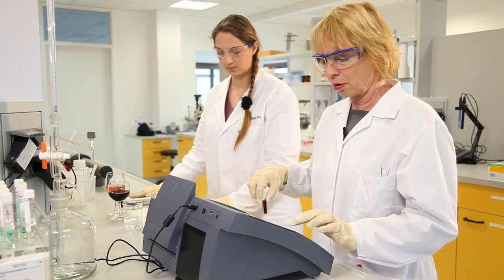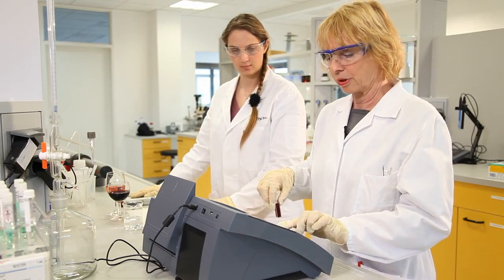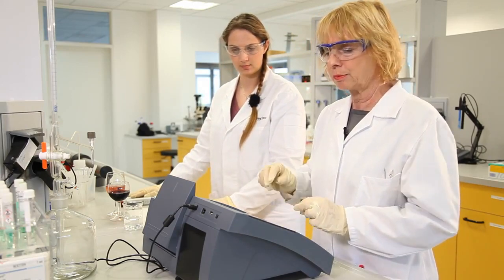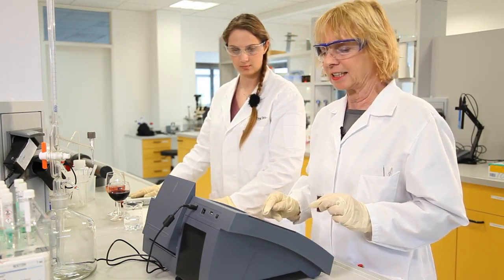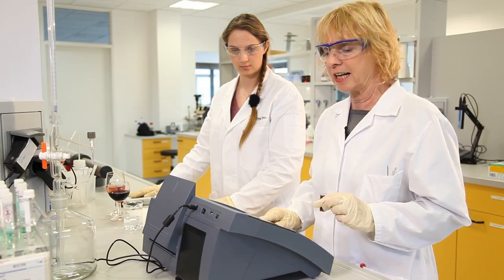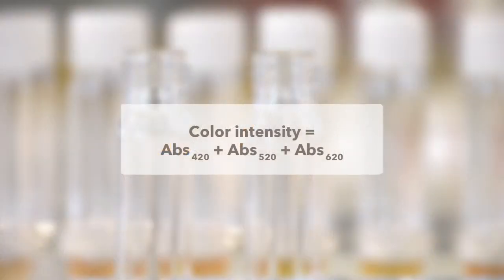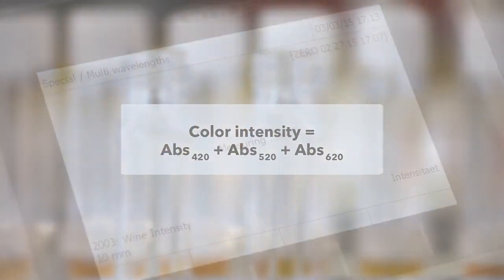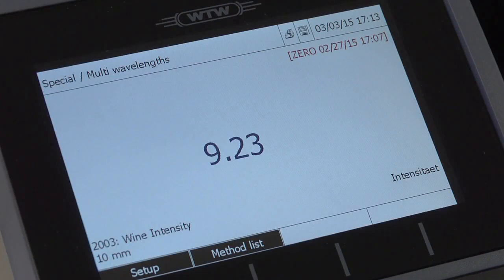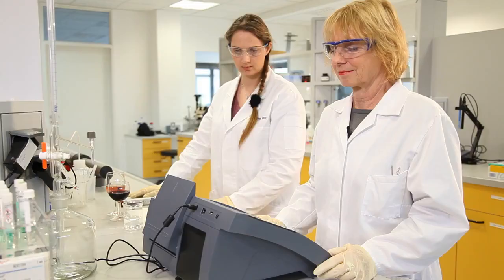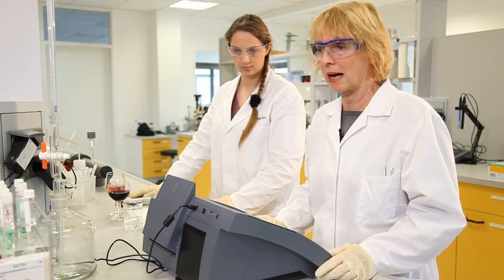Besides the color nuance, we can also determine the color intensity — the sum of the absorbances of three wavelengths: 420, 520, and 620 nanometers. For the red wine, we get a reading of 9.23, and for the rosé it is 0.48.